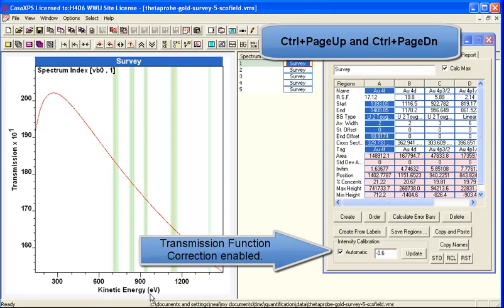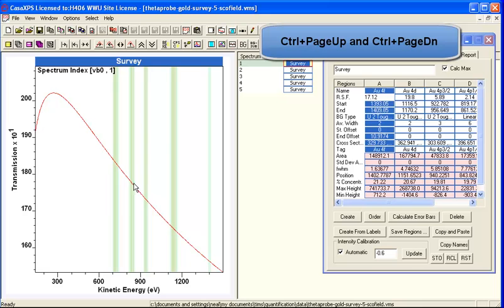So as the kinetic energy increases, the expected signal decreases in this example.